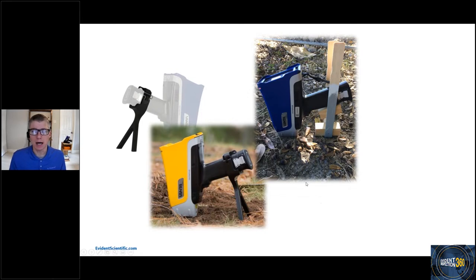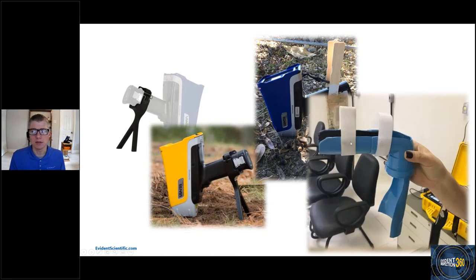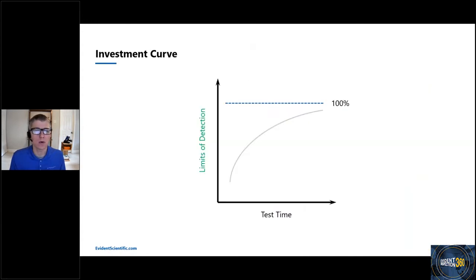Now, I was encouraged then actually that one of our customers in South America sent us a picture of their setup. They're a get her done person as well. A little bit of PVC and some Velcro and a hacksaw, and they've got themselves a makeshift soil foot as well. So I'm a get her done kind of guy, but what kind of effort you need to put in for the return on your investment depends on where you are at, what your requirements are versus the input of energy.